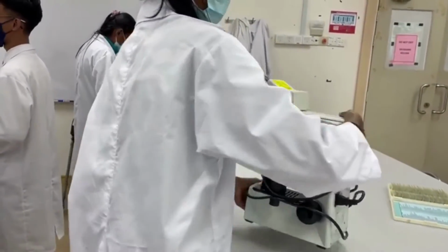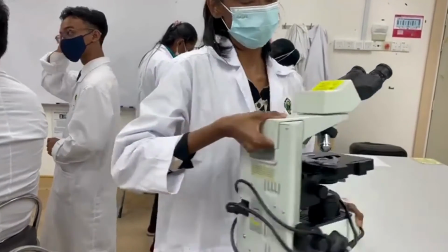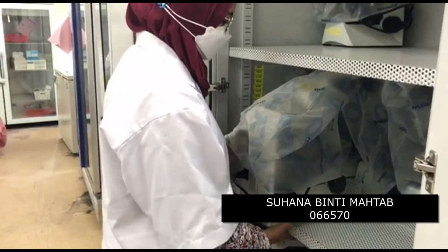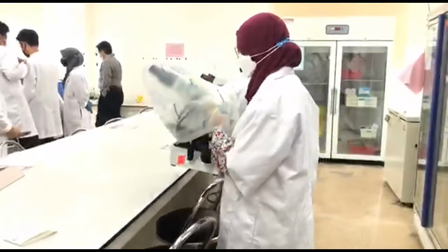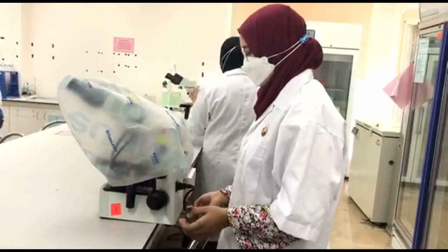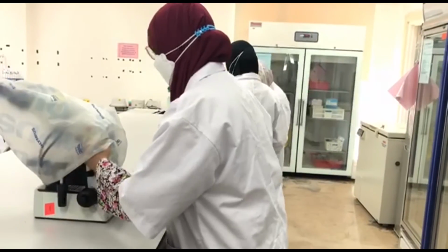Hold the microscope body arm with one hand and the base of the microscope with the other hand. Always carry the microscope with two hands. One goes under the base and the other holds the arm. Place the microscope away from the edge of the table with the arm facing towards you.